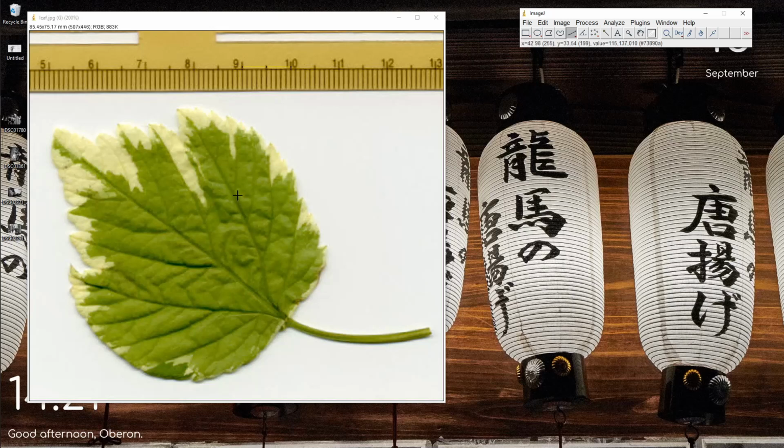Okay, so now we have set the scale on picture number one. And since we set it to global, we won't need to set the scale again for pictures number two up to infinity, because if the tripod height is consistent, it's fine. So now we measure.